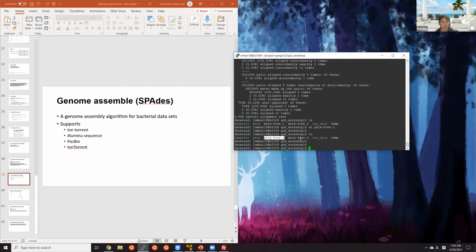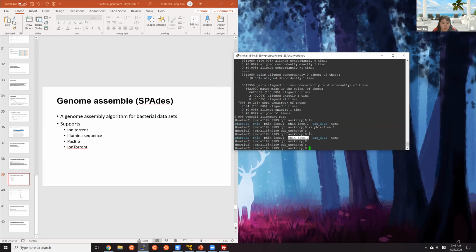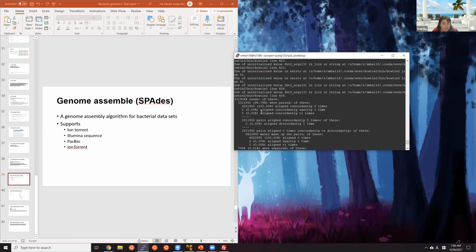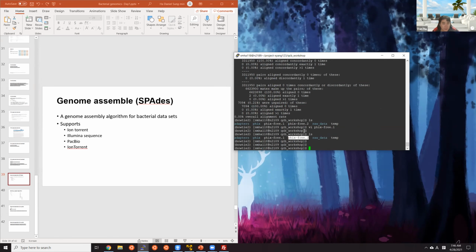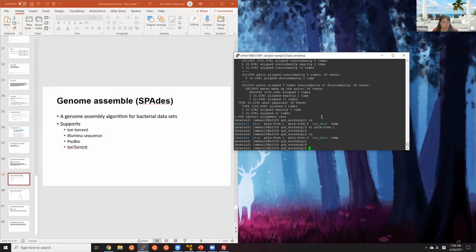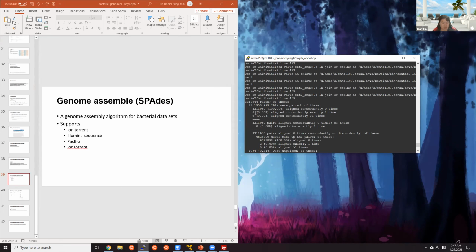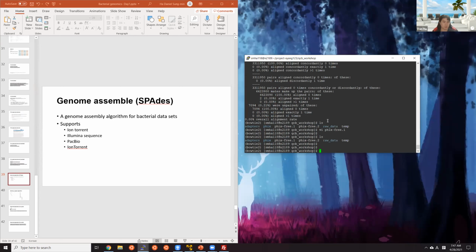So we're gonna feed them into the assembler. Actually, apparently this data has already had PhiX removed. That's why there is 0% aligned with the reference. So you can actually just go ahead and use this file, I guess.